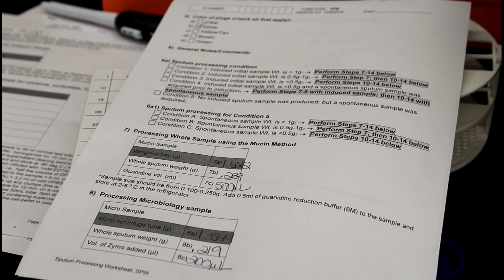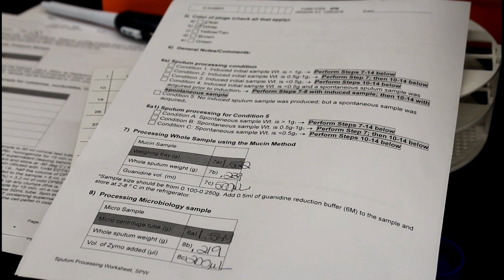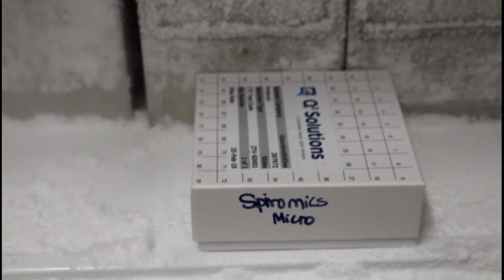So far, we've processed the sample for the mucin endpoint and the microbiology endpoint. The sputum worksheet will look something like this with its values recorded in sections 7 and 8. The sample is stored in the -80-degree freezer.